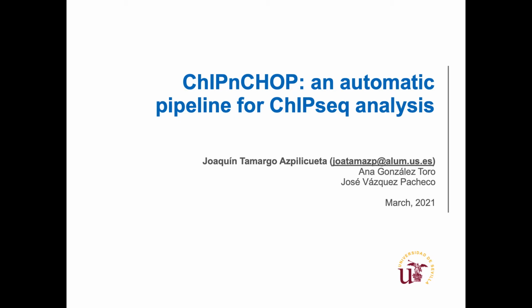Welcome to this tutorial about ChIPnCHOP, an automatic pipeline for ChIP-seq analysis. This software was developed by Ana González Toro, José Vázquez Pacheco, and me, Joaquín Tamargo Azpilicueta, for the subject Bioinformatics and Genome Analysis at the University of Seville.